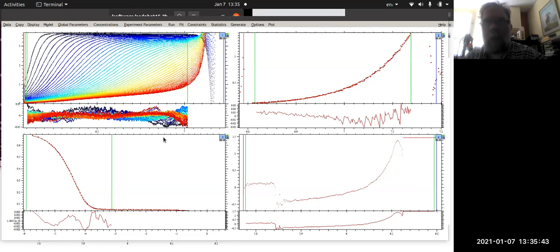In some instances, depending on the model you pick with sedphat, it wants ratios and a total concentration. In other cases, it wants individual concentrations. And you have to be careful with it because in some places sedphat uses micromolar, in other places it uses molar. And it's usually obvious, but you should be aware that it's not always 100% consistent. They almost never use nanomolar for any of the concentrations, but it's something to be aware of.